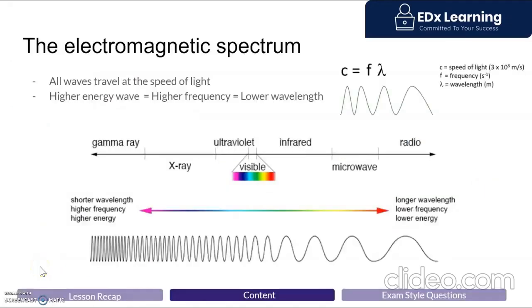Before we even jump into AAS, let's have a look at what the word spectroscopy refers to. Spectroscopy is the study of how matter interacts with energy. So we're going to input some kind of energy to matter and observe how it responds to determine its concentration or its bonds, etc. Now with AAS, the energy that you input is electromagnetic radiation.